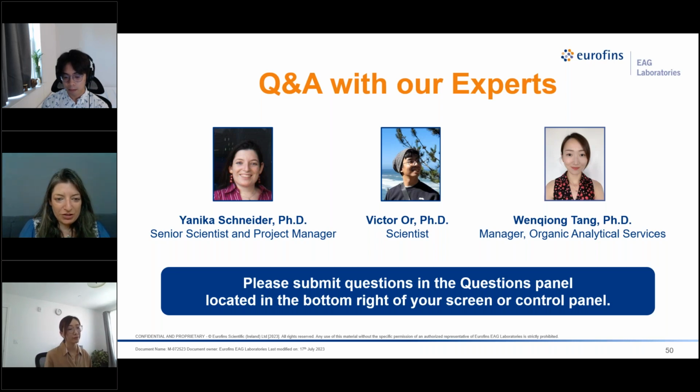Okay, I have another question for Victor. What are the physical limitations of NanoIR versus IR? So physical limitations for samples. Physically, we are much more limited to smaller size samples because we can only accommodate a max height of like 18 millimeters.